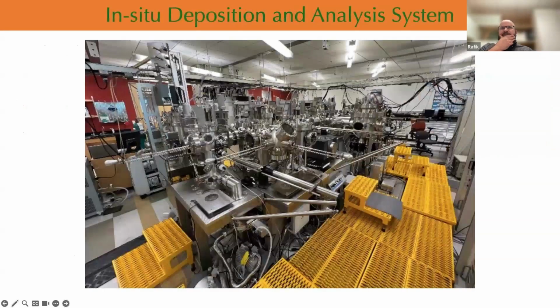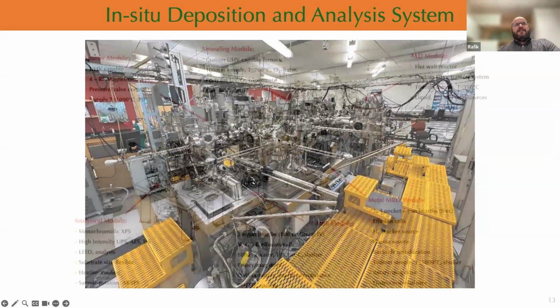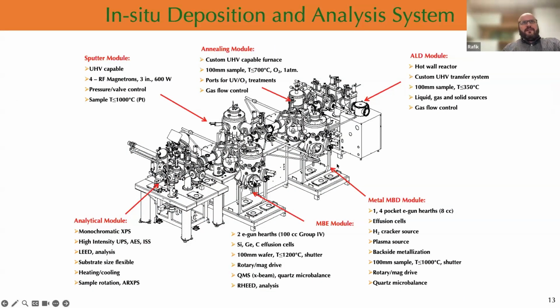So I have the first lab, which we call the cluster lab. This is an image of this lab. It is not clear here what we have, but in this schematic you can see that we have different deposition chambers and an analysis chamber.